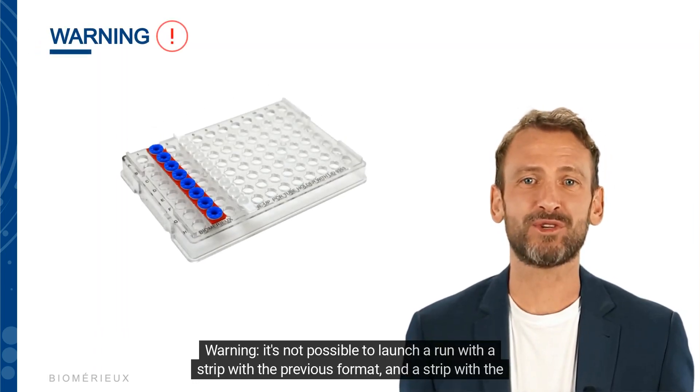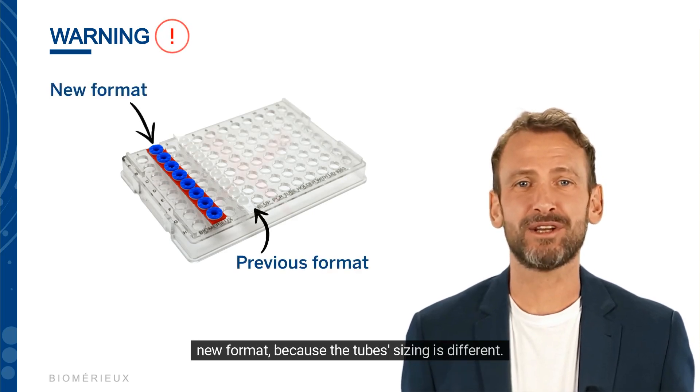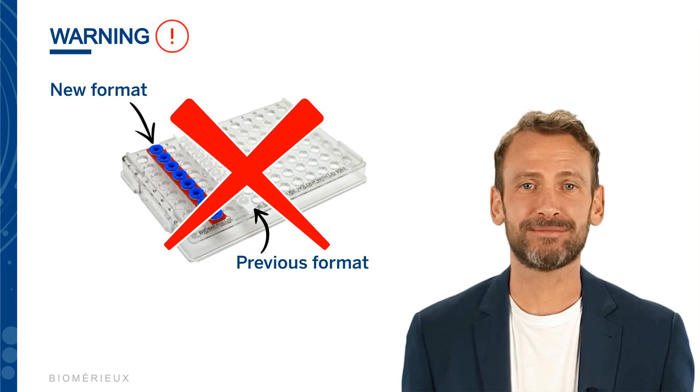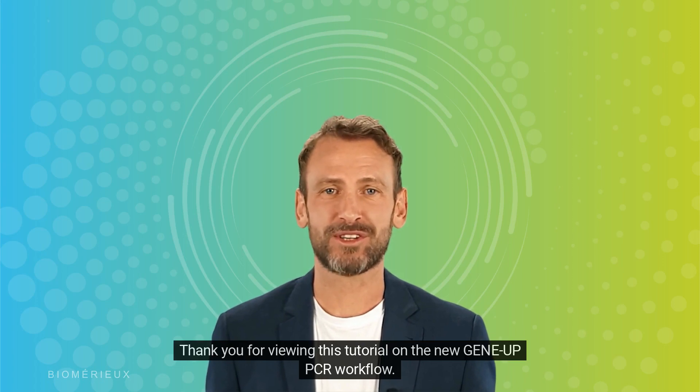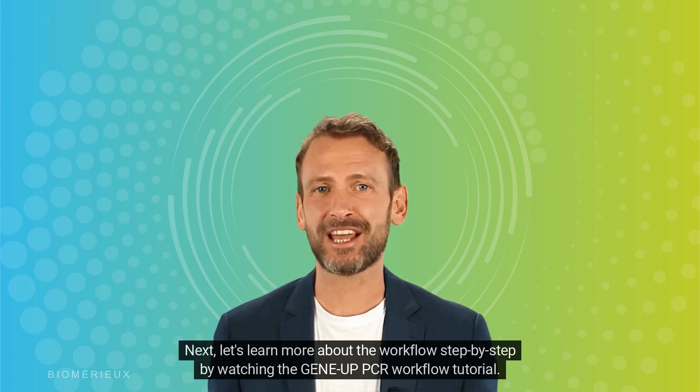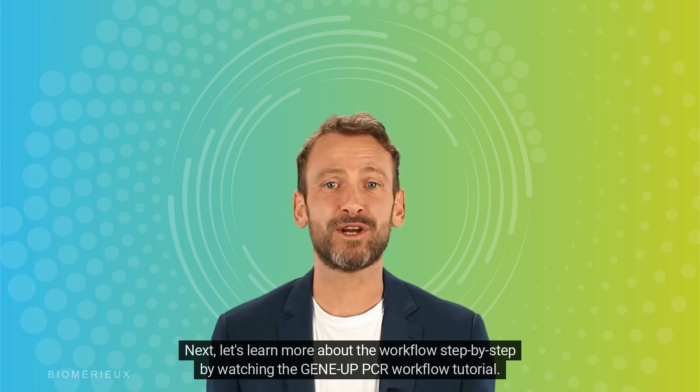Warning: it is not possible to launch a run with a strip in the previous format and a strip in the new format together, because the tube sizing is different. To learn more about the workflow step by step, watch the GeneUp PCR workflow tutorial.